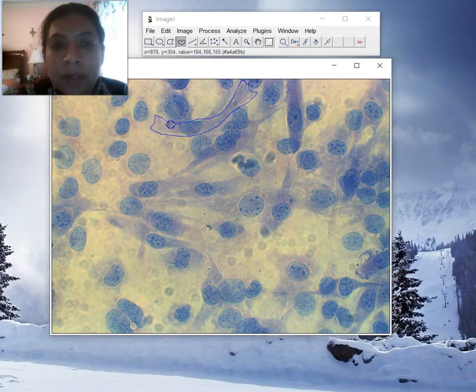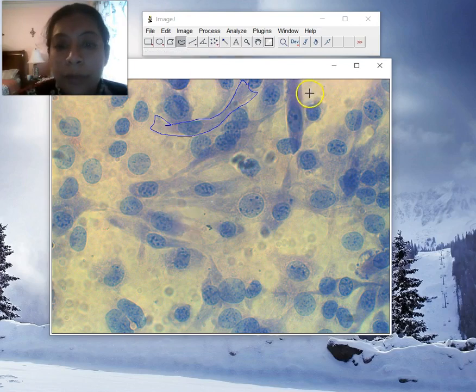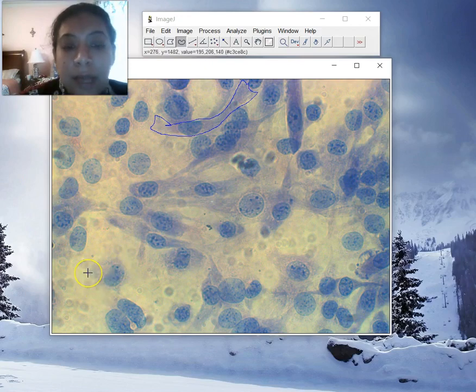Here, for example, this cell is nice and long, it's getting thinner, and it's definitely showing signs of different morphology. If you look around, you'll see many cells in the central cluster exhibiting exactly that type of morphology, where they're beginning to differentiate and getting ready to merge with neighboring cells to form the myotubes, while other cells are still the same boxy, undifferentiated ones.